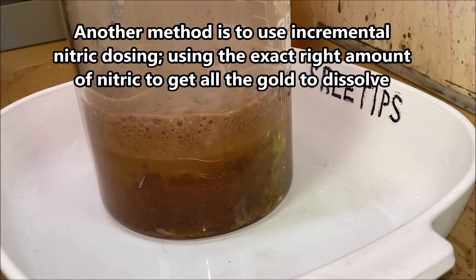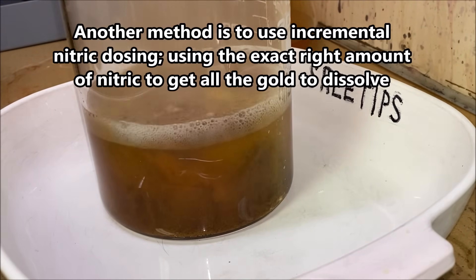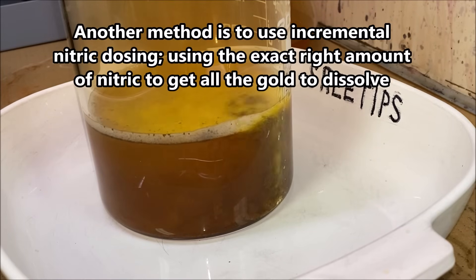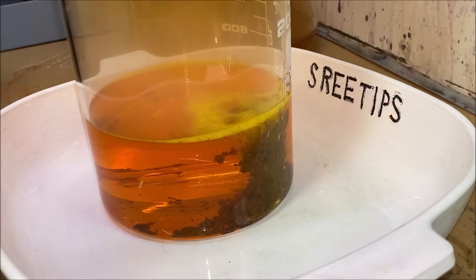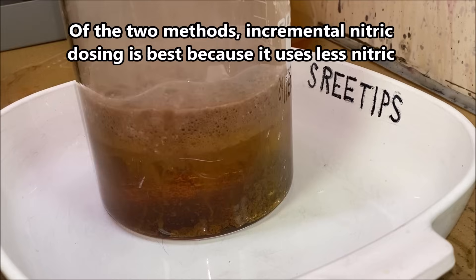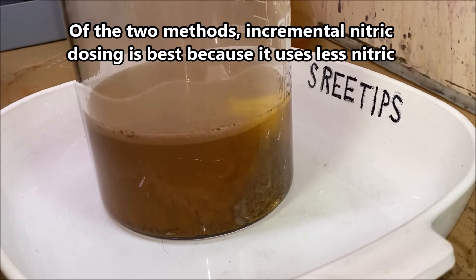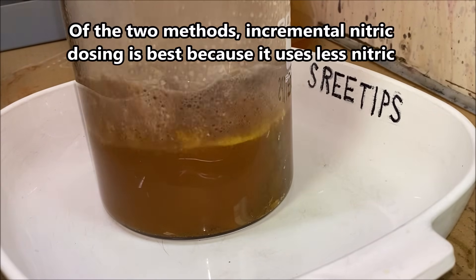The solution is boiling hot, and that's contributing to the gold going back into solution. I'm just going to keep adding more SMB until I get it all precipitated out and it stays precipitated. Look at that purple foam — that looks pretty cool.